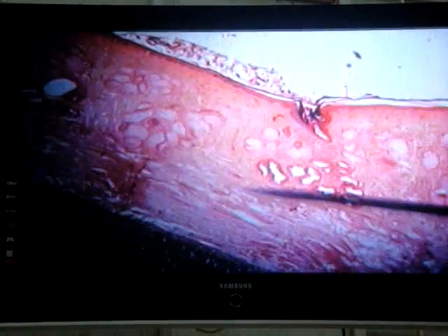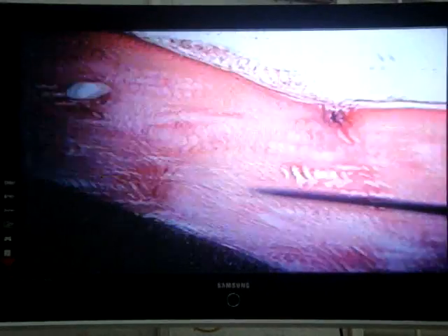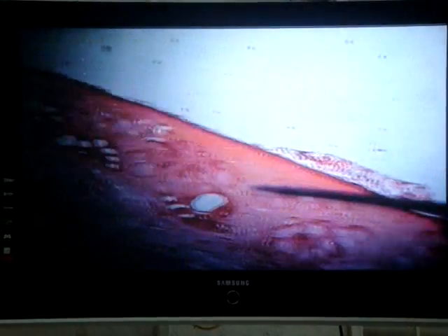Well, thin skin on the other hand, we will observe immediately the fact that the epidermis is not thick anymore. What is the epidermis now? It's slightly diminished.